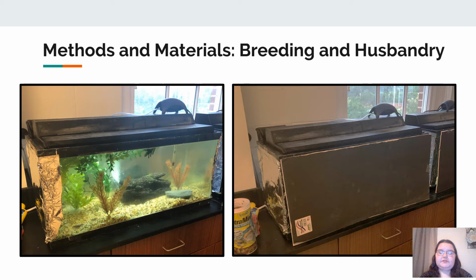And so once we identified those mollies, from a kind of puffy maternal brood pouch, we gave the mollies a cesarean section. To do this, we anesthetized the female with MS-222, and then we extracted the pups, and then we put the female in a recovery tank for a few hours, and then once we knew she was swimming well, we put her back in a regular tank to heal.